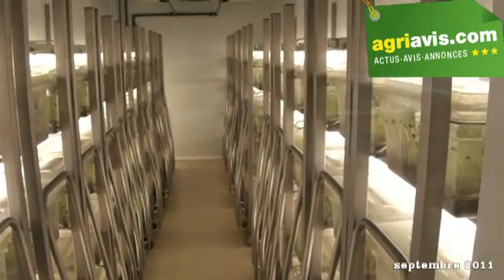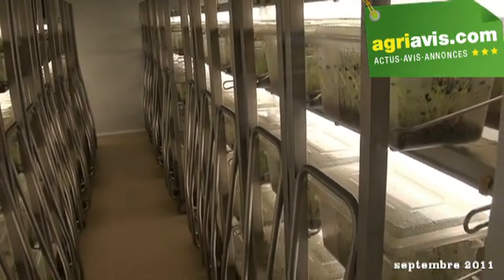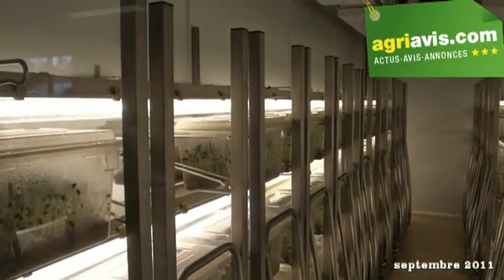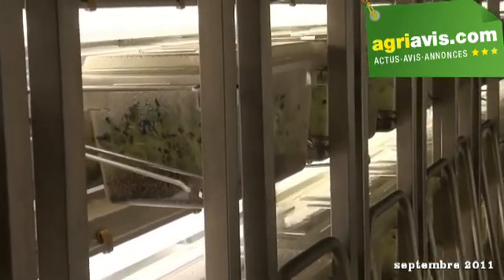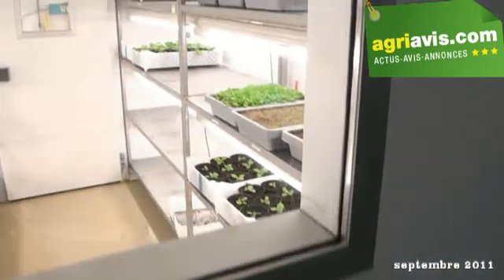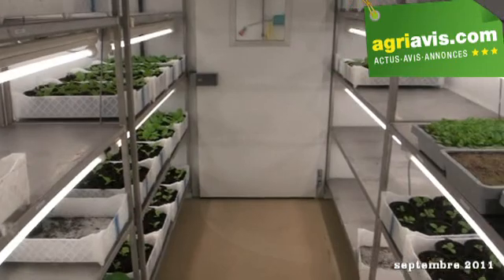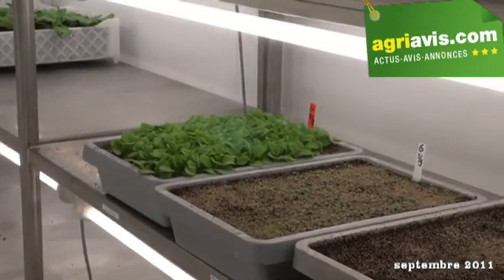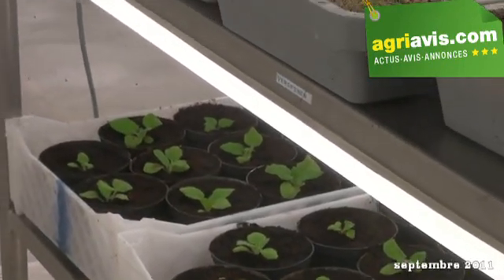For Vitality it's very important that we see how that growing point has developed. In the process it's interesting to have this information because it tells you something about germination potential. When our producers come with the seeds, we check germination energy, the speed of the seed, and what total germination we can expect. Then we have a lot of possibilities of processing to increase the quality.